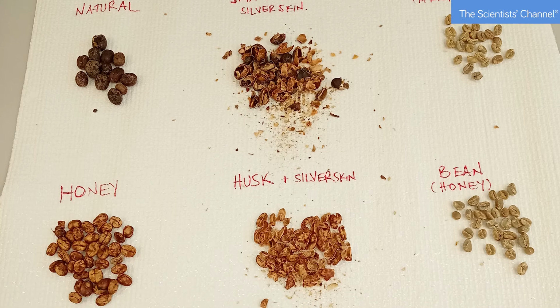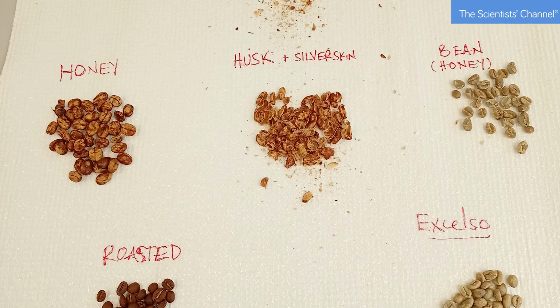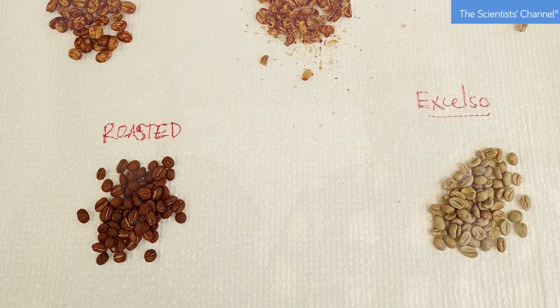In practice, the compounds of interest can be differentiated from artifacts or contaminants derived from sample prep. It is possible to compare procedures, different samples, such as the types of coffee samples, part of the product, or other variations that help to obtain a comprehensive picture beyond targeted approaches and without missing priceless information.